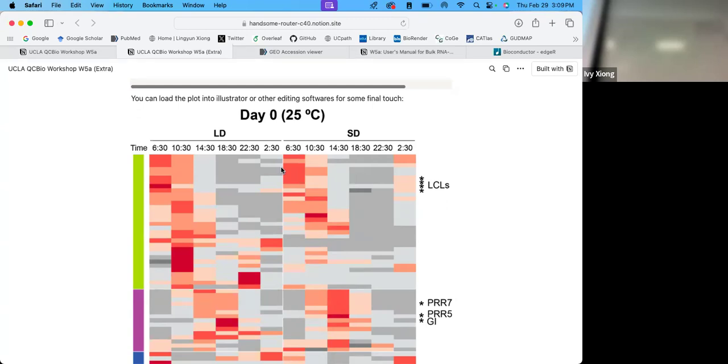Yeah, try the pipeline, hopefully you can get this. Oh, yeah. So you found some. Yeah, so I'm going to go through. They have to finally get them. Yeah, try to find the information files now, and you can do the next steps. So once you have them, you can just run it.